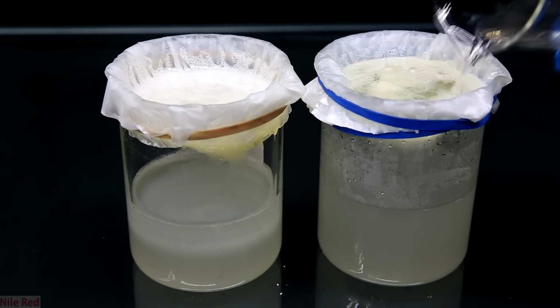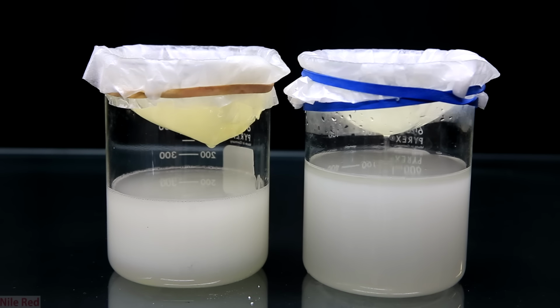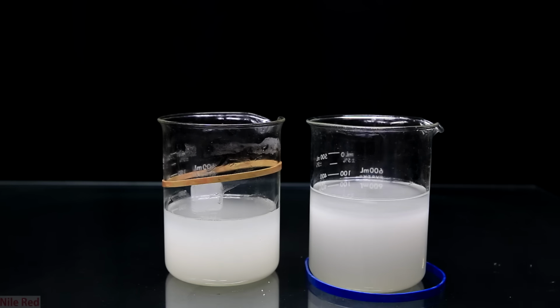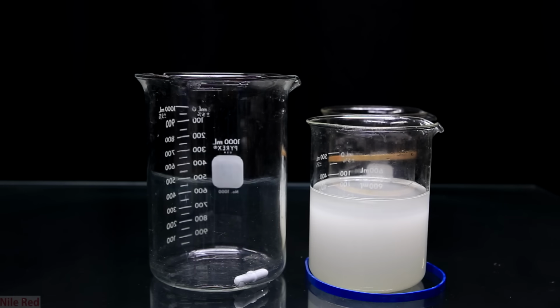After everything had filtered through in the second filter, I added a little bit of water to wash the polymer. The water slowly trickled through, and what was cool is it formed a little bit of a layer on the top. The density of our solution is much higher because it has a lot of stuff dissolved in it, and so the distilled water, when it slowly drips in, it just floats on the top.